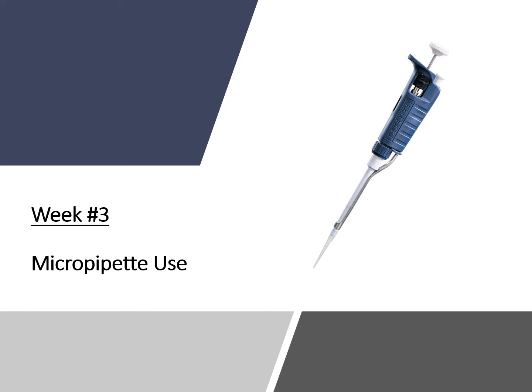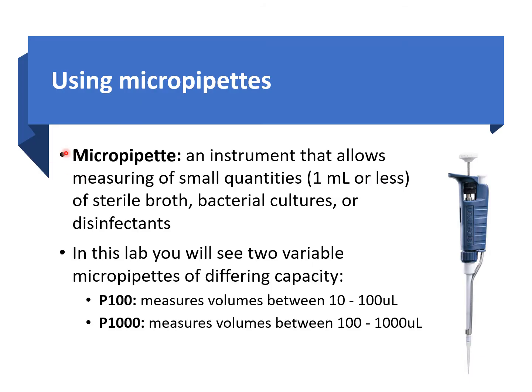Hello everyone. This week we are going to talk about micropipettes and how we use micropipettes in a microbiology lab. Let us introduce what micropipettes are. Micropipettes are instruments and they look something like this.